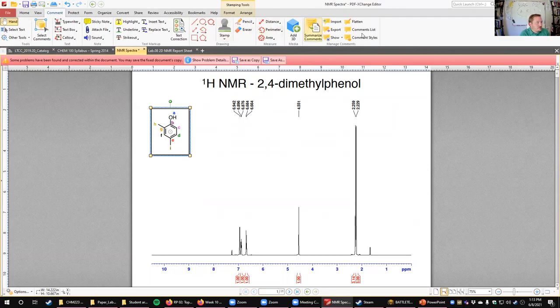Just going to put this here so we can reference it while we're going. We know that we can say that these two peaks at the bottom, we don't know which is which yet, but we know that it's going to be I and H. Because if for no other reason, they're the only ones with the right integration. There's only two methyls, which means that these two that have integration three have to be I and H, and we'll worry about which one's which later.